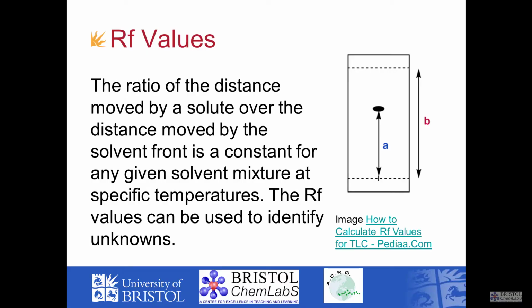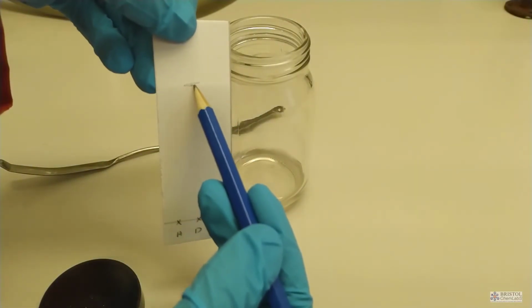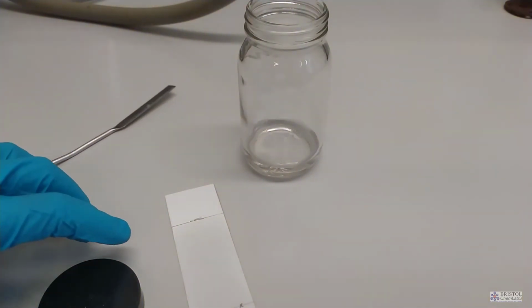The plate is then left to dry and put back under the ultraviolet light, and the positions of where the spots have moved is marked. If the product contained a mixture, we would see a dot for each component. If the product was not benzocaine, the dot or small circle would not be exactly in the same position as the pure benzocaine sample it was run against.